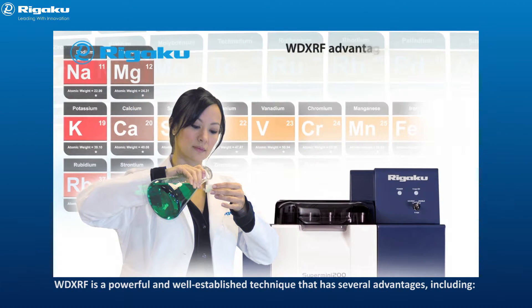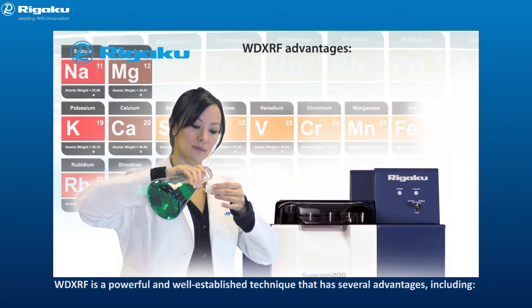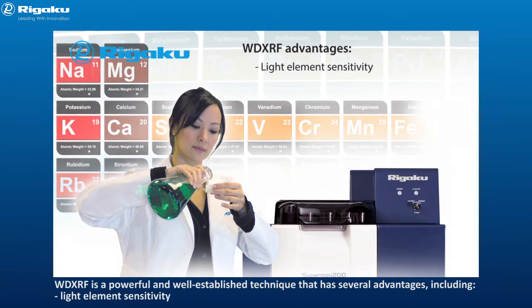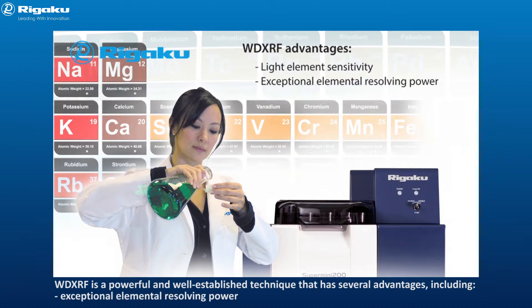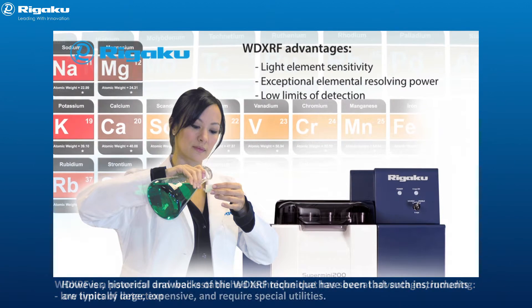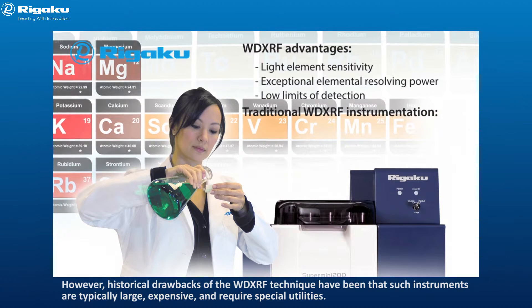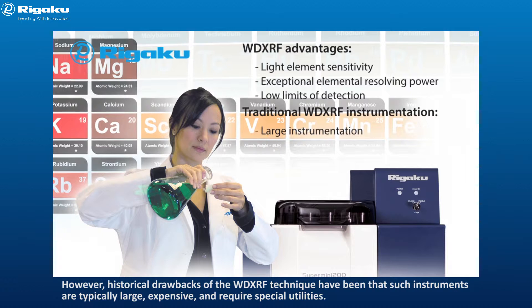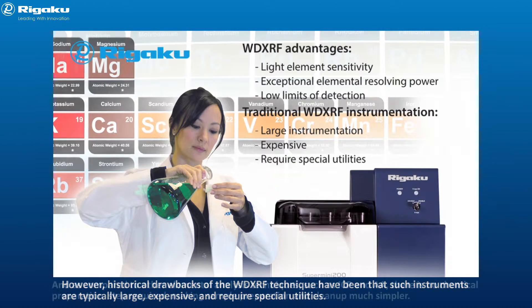WD-XRF is a powerful and well-established technique that has several advantages, including light element sensitivity, exceptional elemental resolving power, and low limits of detection. However, historical drawbacks of the WD-XRF technique have been that such instruments are typically large, expensive, and require special utilities.